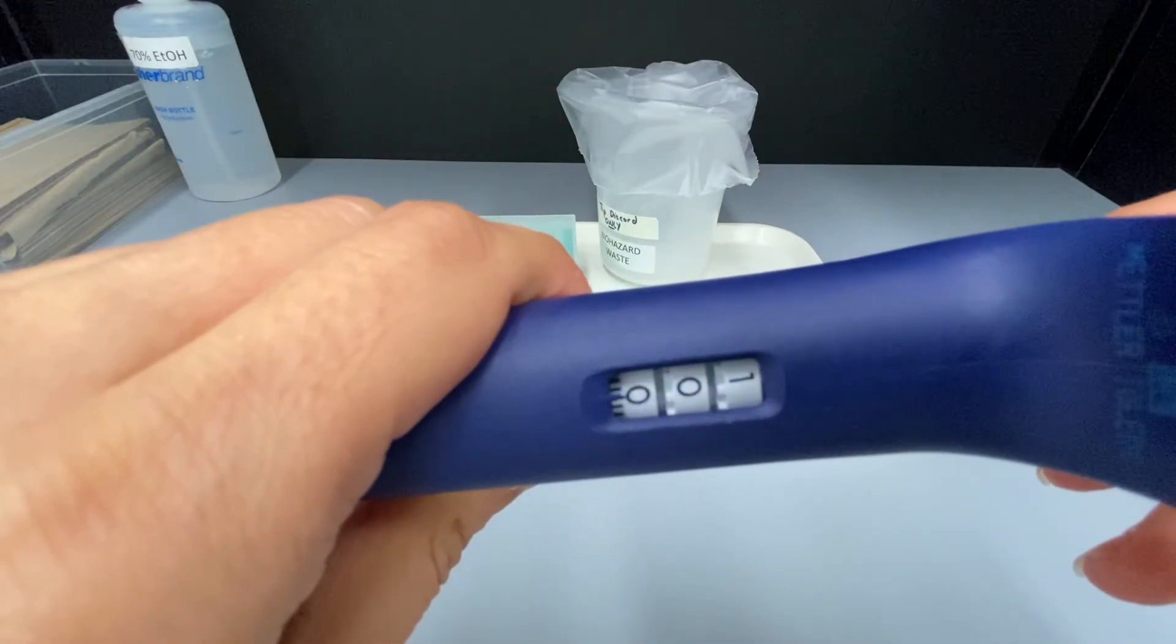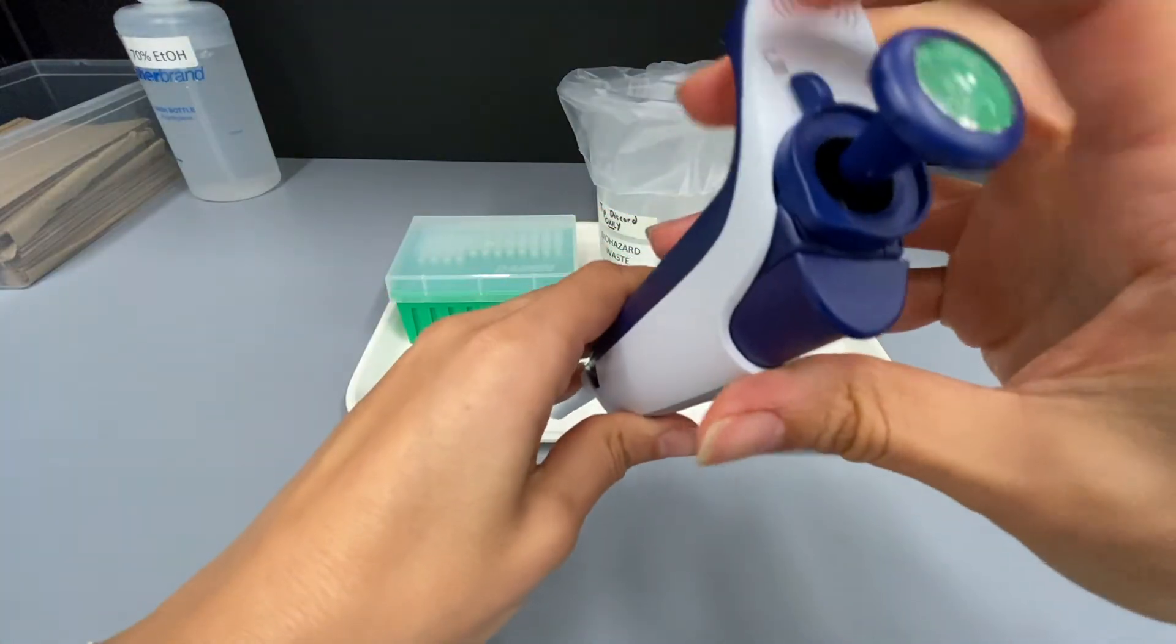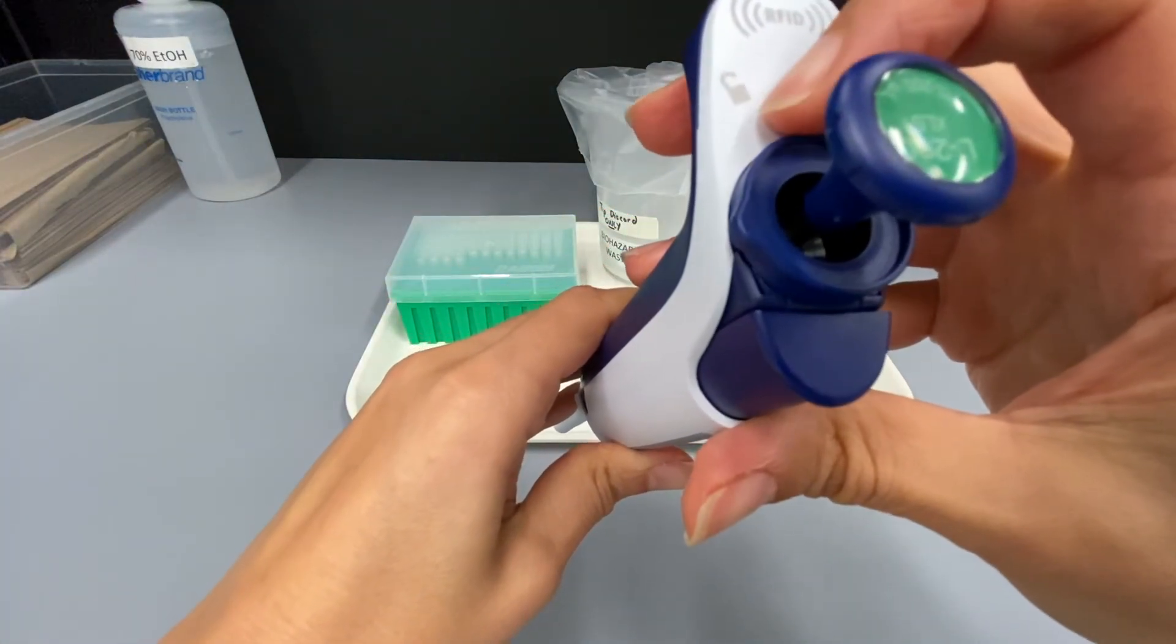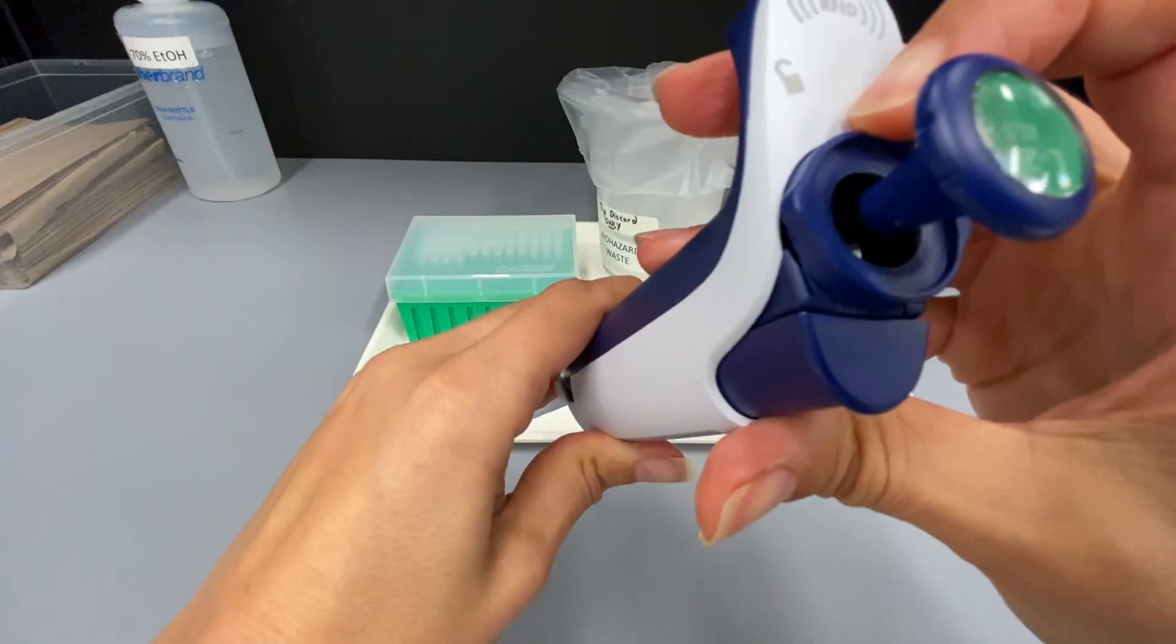Never adjust the pipette above the maximum or below the minimum as this could damage the pipette. Once the pipette is set to 100, lock the pipette if it has a locking mechanism so that the volume is not accidentally changed.